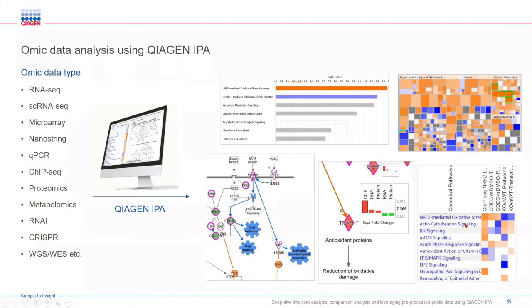Now in addition to all of this you can also generate custom networks where you can see how a gene of your interest is connected to a downstream function.